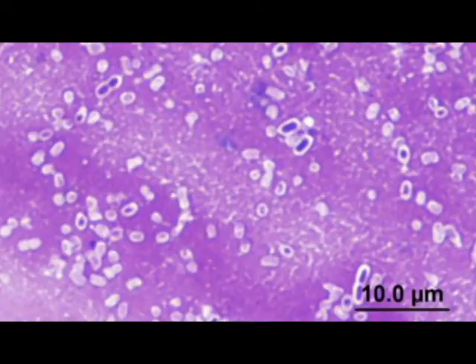In your lab books there's a picture of a spore stain and a picture of a capsule stain. These are stains that we can't do in labs. You could be given a photograph of the spore stain and the capsule stain, and be asked which one's which. Or a true or false question, which is: a capsule stain will stain both the bacteria and the capsule the same color, true or false.